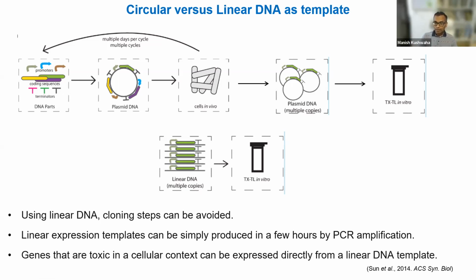But there is a problem. The problem with linear DNA, of course, is that it's not tolerated well in at least extract-based cell-free systems. If you are making a pure system where you have purified all the components and added them together, this is probably okay because it doesn't have any exonucleases in it. But if you're using crude cell extracts, and we'll come to why sometimes those are quite important to use, then your DNA is not very stable, and it'll quickly get degraded by the exonucleases that are in the system.